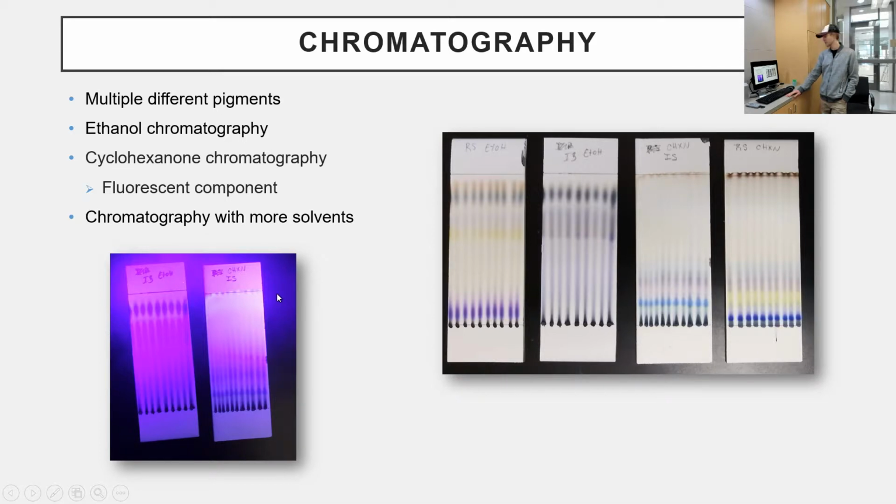Yeah. And so, after that, I took a UV light and shined it on all of our solvents. And found them fluorescent. Now, how would you test if this chromatography experiment was just your solvent, a fluorescent compound?